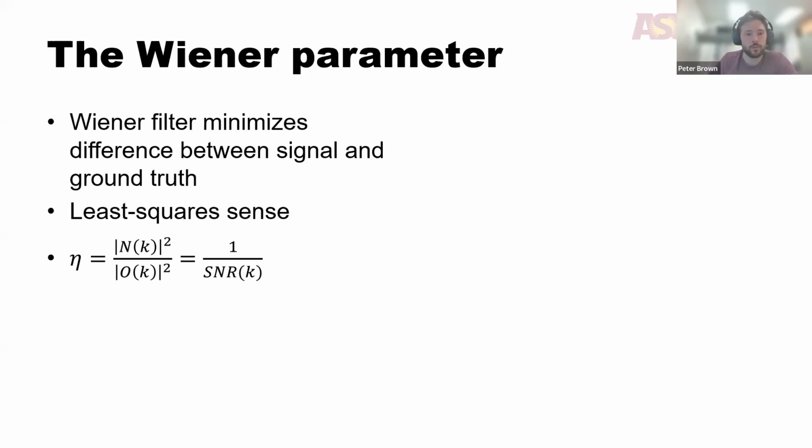Where the signal to noise is very low, eta becomes large and then efficiently cuts off the noise amplification process that we discussed before. However, it's not easy to implement this ideal eta because, as you could see, to estimate the signal to noise value, we need the actual signal value, which is what we're trying to reconstruct to begin with.